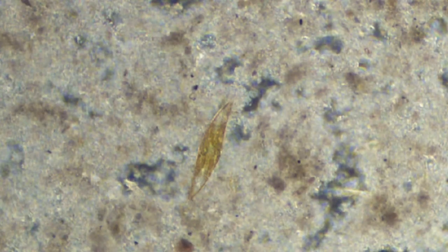Trying to look for any other movement in here. I'm just seeing some diatoms again. Not seeing any significant ciliates or anything. The diatom moving through the debris here. Big, beautiful golden diatoms here.